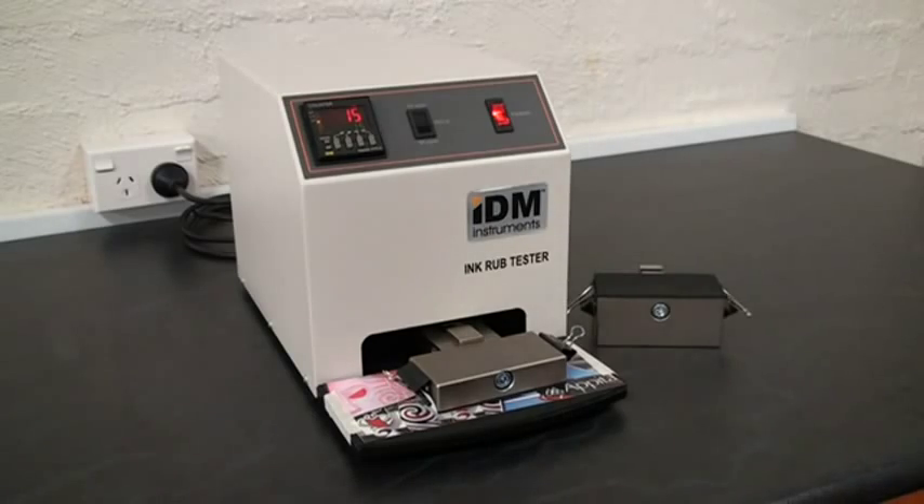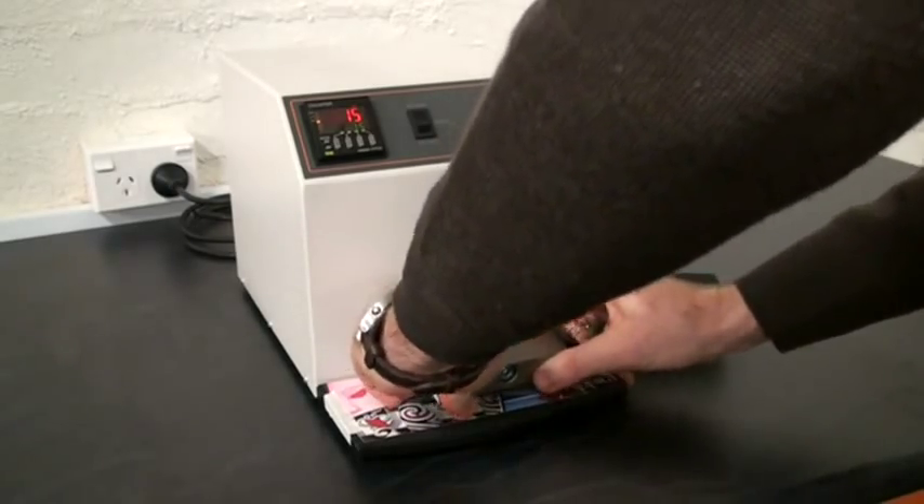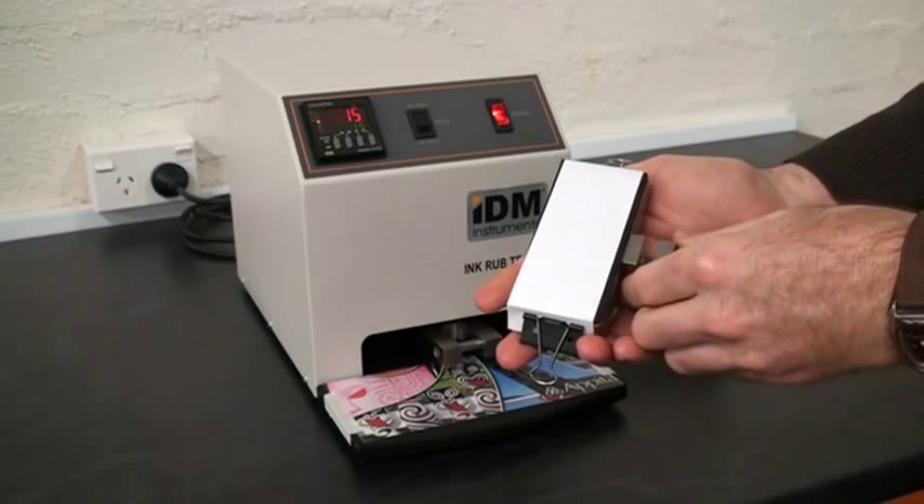At the end of the test, the instrument automatically stops, so we can remove our weight to assess how much scuffing has occurred in ink transfer.